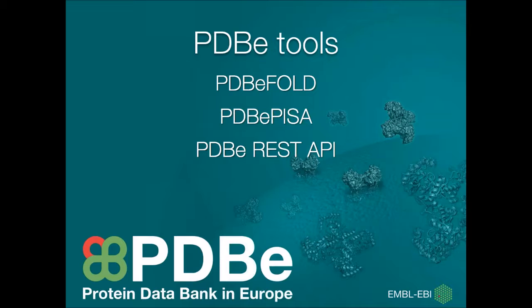We also have our REST API, and this is used for programmatical access for data, so people interested in bioinformatics or large data sets.